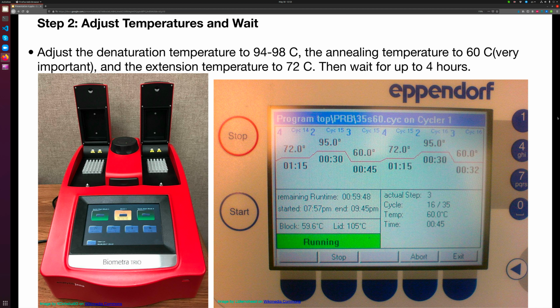You can see, make sure your temperature, like cycle 1, if you see that the temperature is incorrect, so it's not 60.0, then oh no, there might be an issue. You might have a little bit of a problem here.